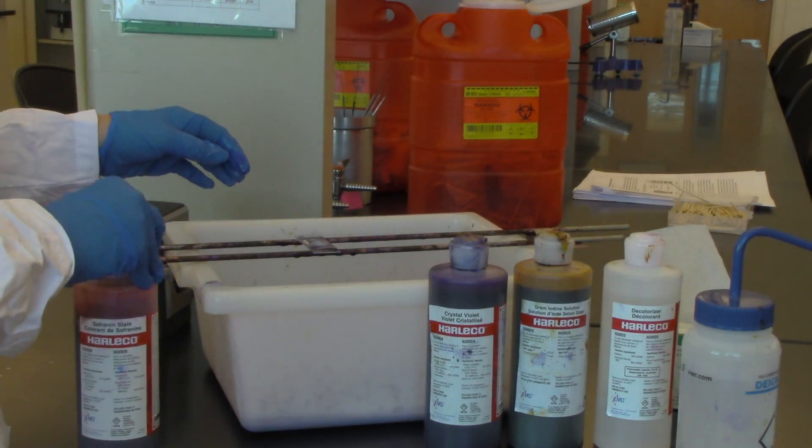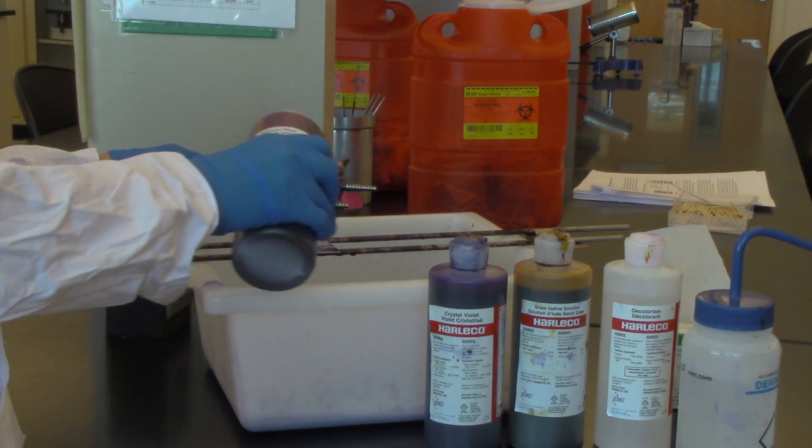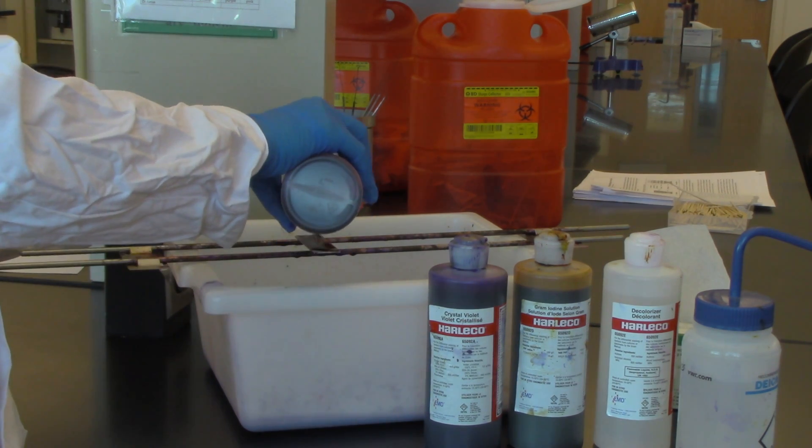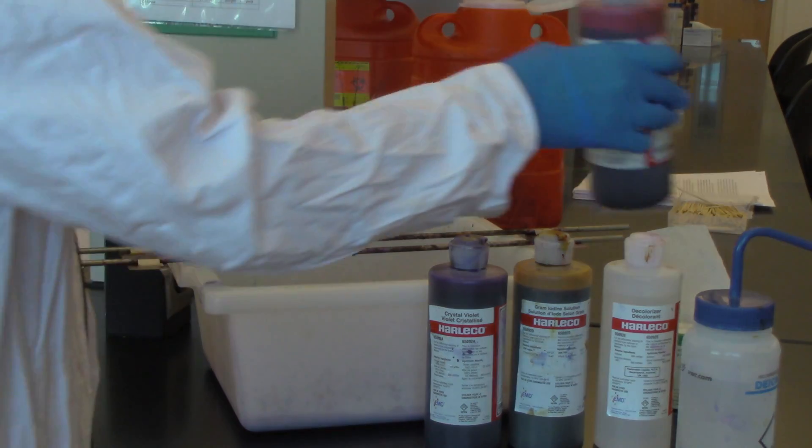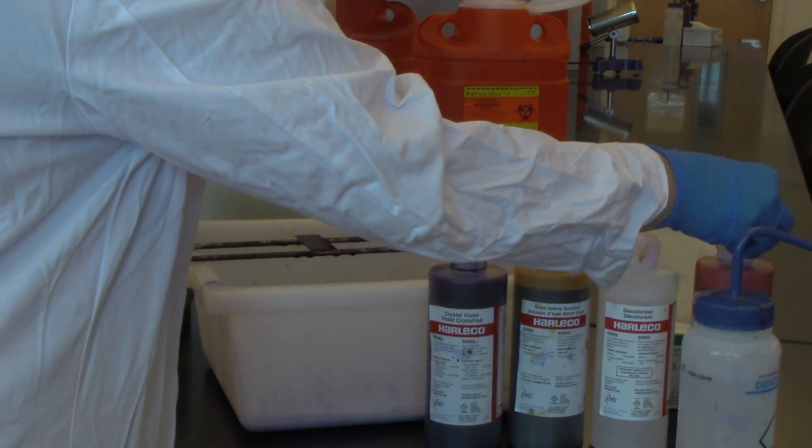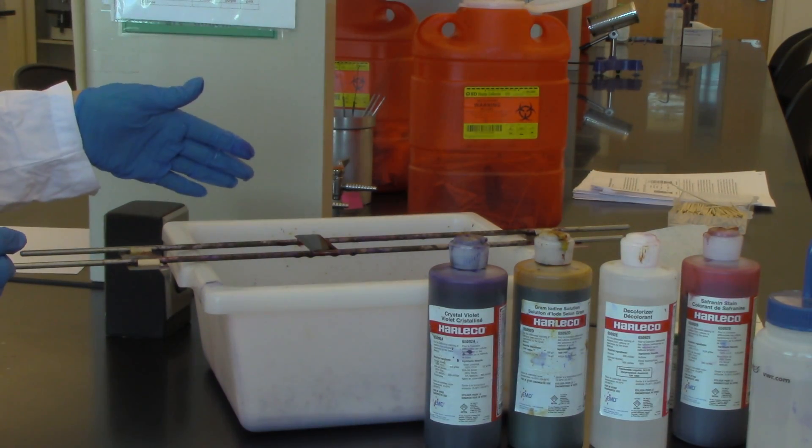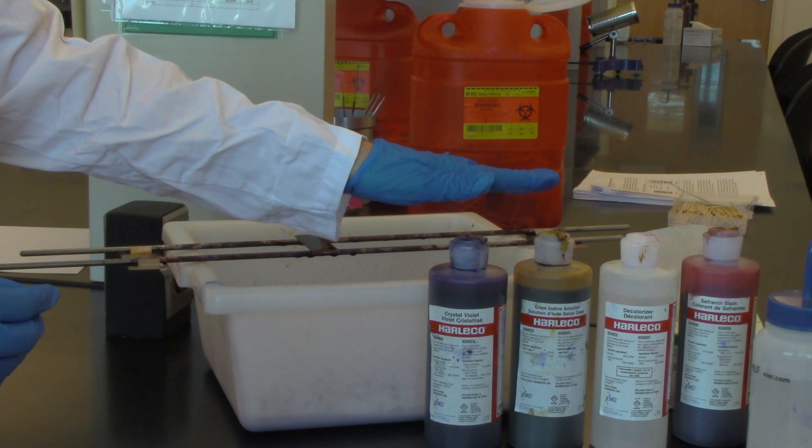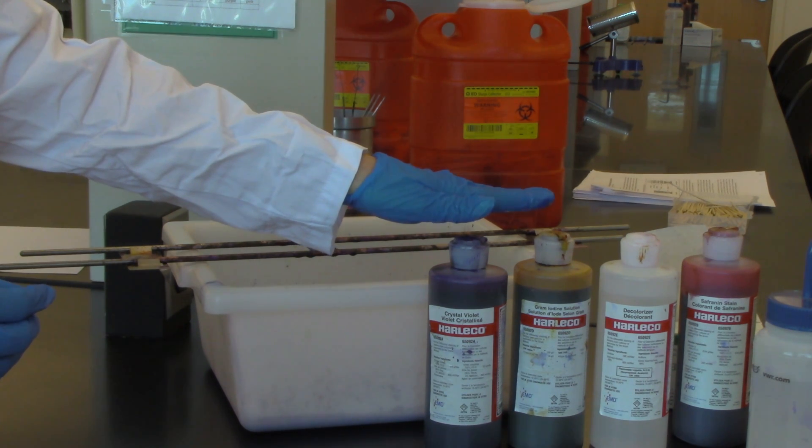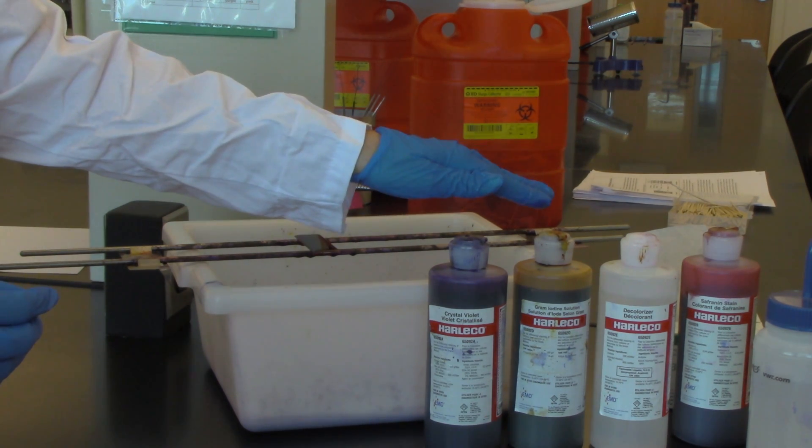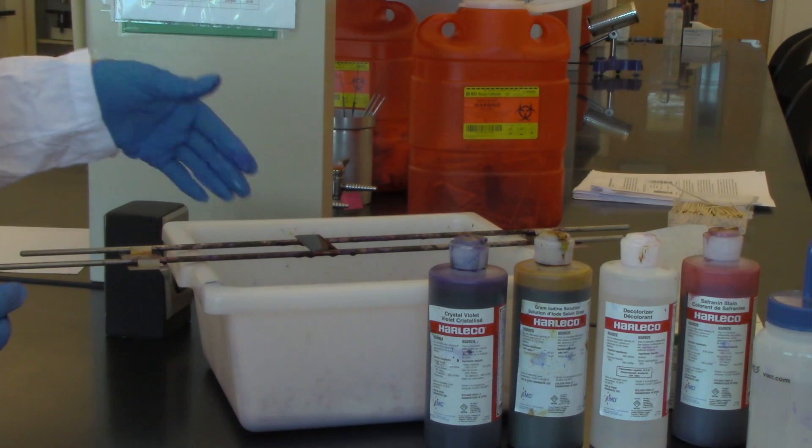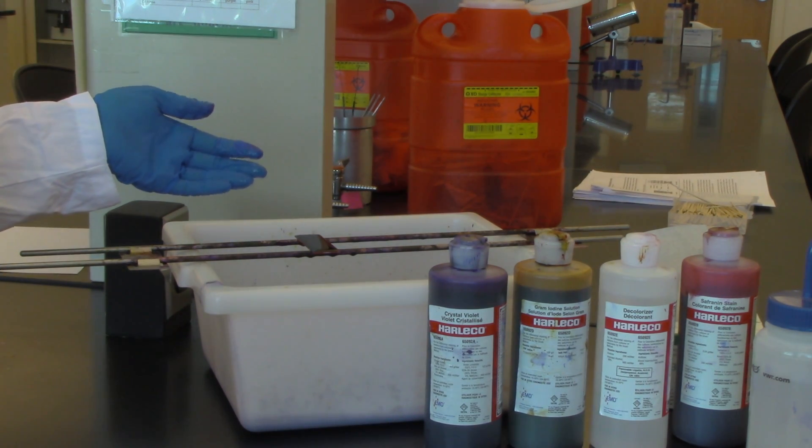Finally, I'm going to add my counter stain or what's called a secondary stain, and that is safranin. If you were to have a slide with specimen that had all gram-negative cells and you only added the crystal violet and the gram's iodine, it would end up washing out at the decolorizing step and you would be left with clear cells.